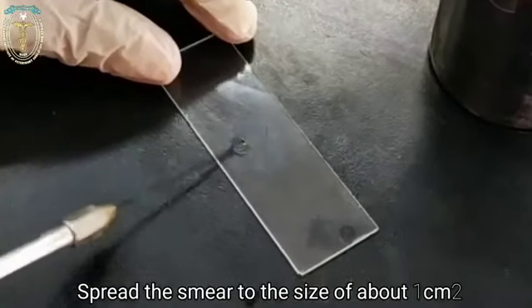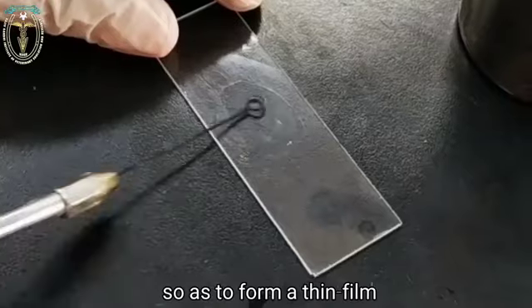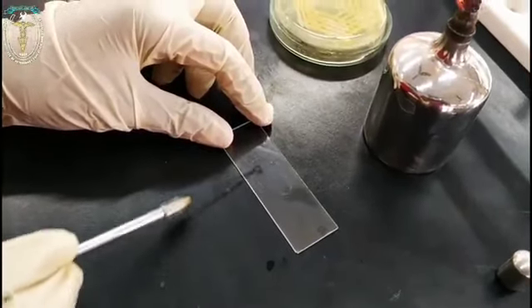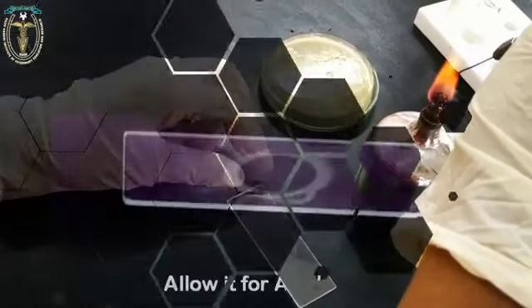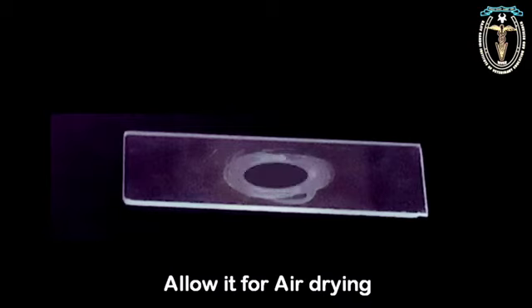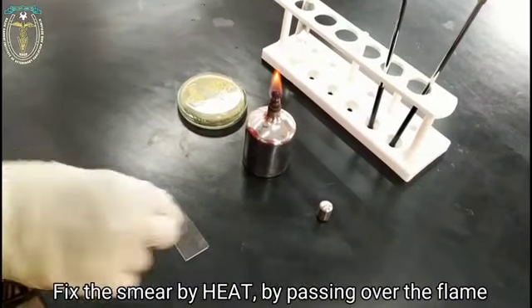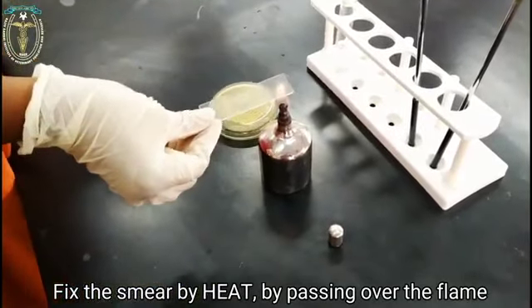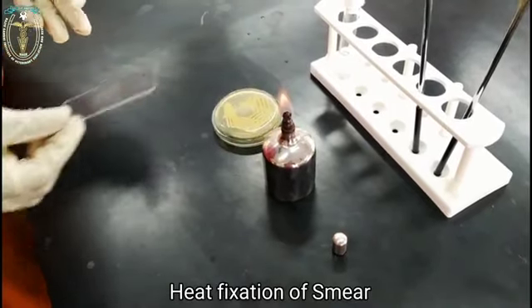First, prepare the smear from the sample. Spread the smear to the size of about 1 centimeter square, so as to form a thin film. After spreading, allow it to air dry. It may take 2 to 3 minutes for drying. After air drying, fix the smear by heat, by passing it over the flame 2 to 3 times with a slow sweeping motion. This is called heat fixation of the smear.